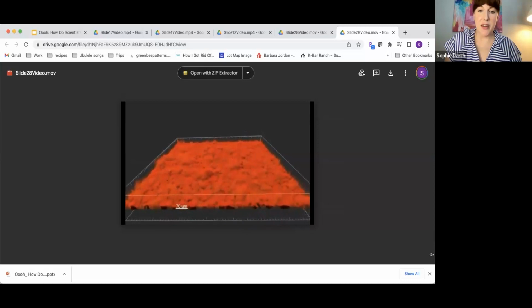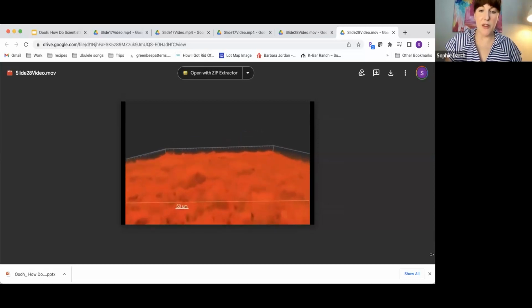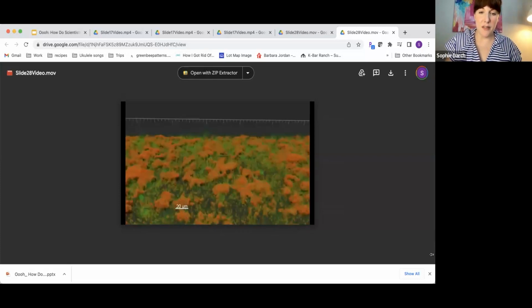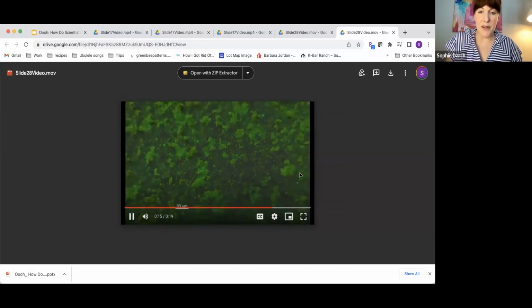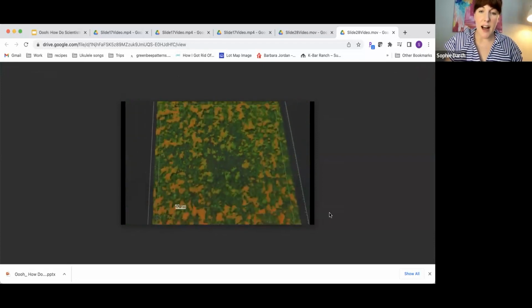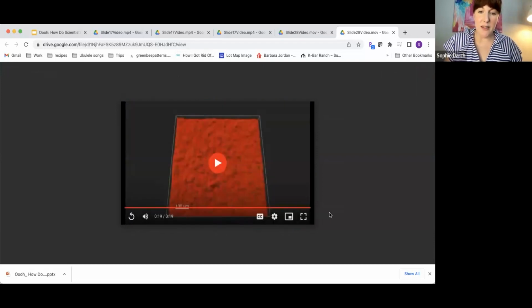Yeah, so what you'll see is the red, which is all the bacteria, and then certain ones are green, and that means that some of this bacterial population are talking to each other. So even here you can see there's little single cells, there's groups of cells that are green, and this is basically how we can study those bacterial conversations. So we can actually identify which cells are having these conversations, which ones are quorum sensing and which ones are not.